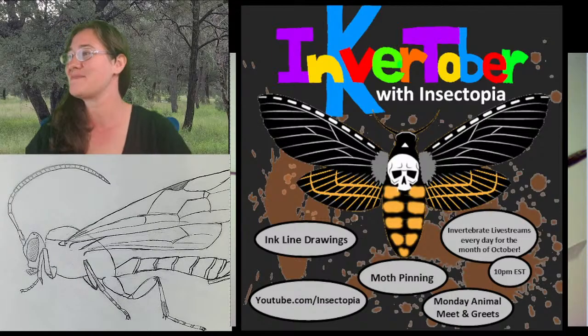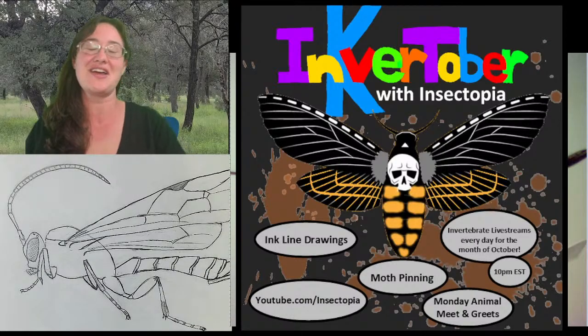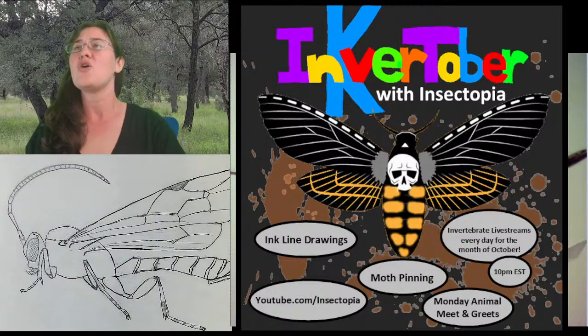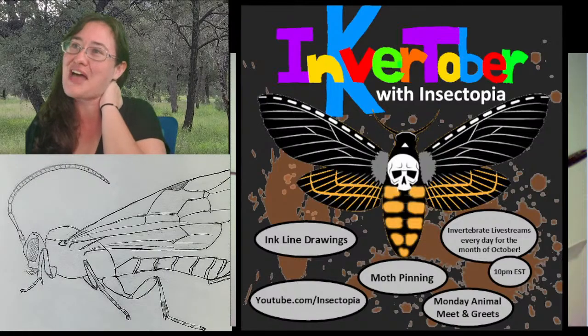Yes, take notes about which ones we want to sketch. That is our goal. So when we're looking at our insect collection and doing our collection tour, write down which ones you want to sketch, or even what types of insects you want to be leaning towards, because there are a whole bunch of them.